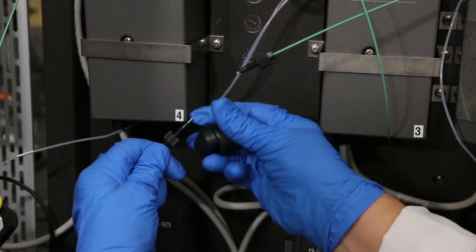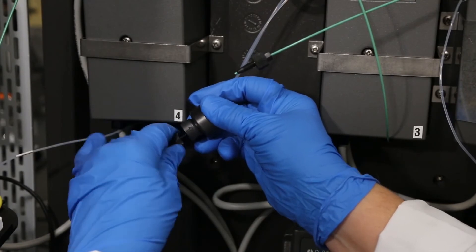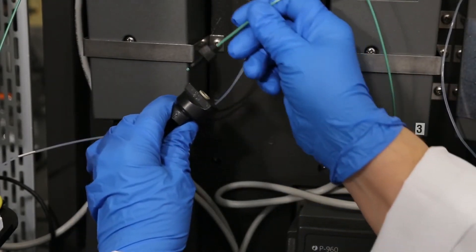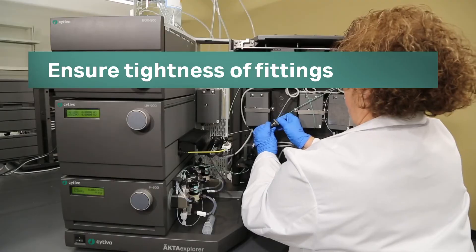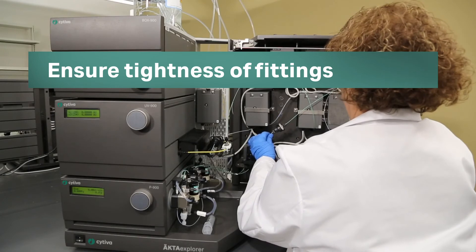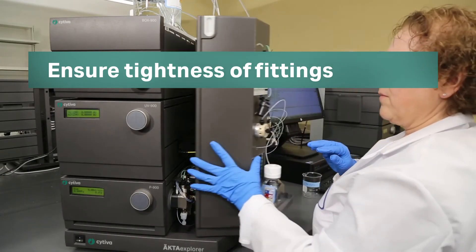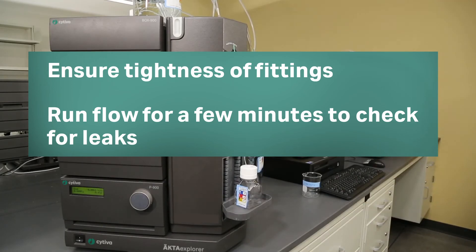Reinstall the filter housing on the instrument in the same location from where it was removed. Ensure that the tubing is tightly secured in the fittings. Once you have finished reinstalling the online filter, run a flow through it for a few minutes to check for leaks.